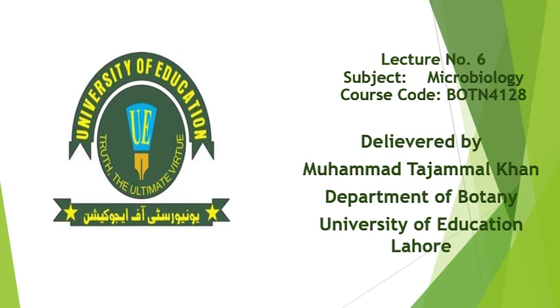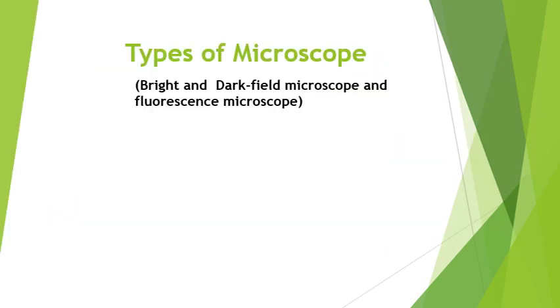Dear students, Assalamu alaikum. Today we will discuss a topic related to our elective subject, that is microbiology, and the course code of this subject is BOTN 4128. So today in this lecture our focus is on types of light or compound microscope.